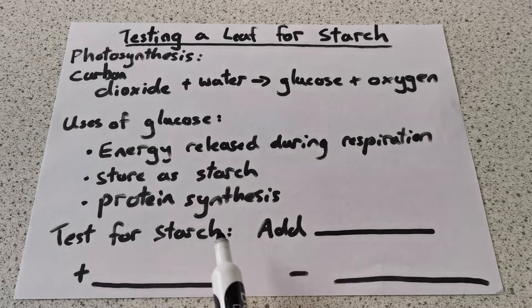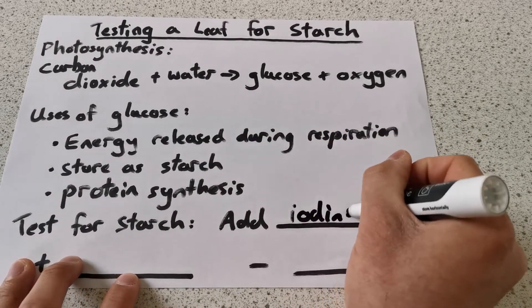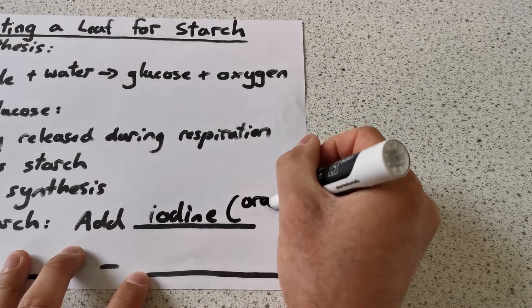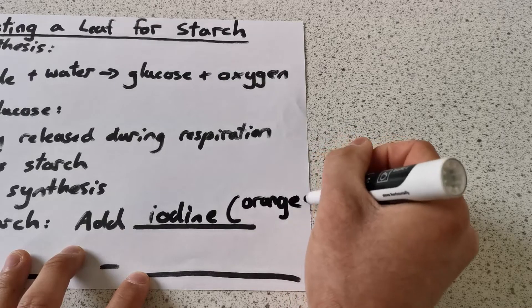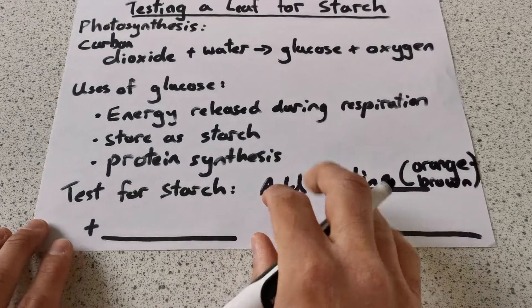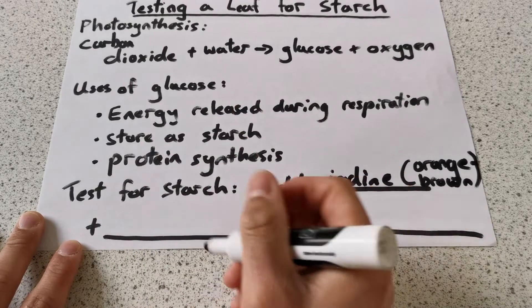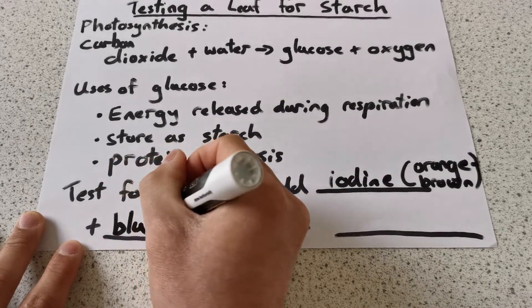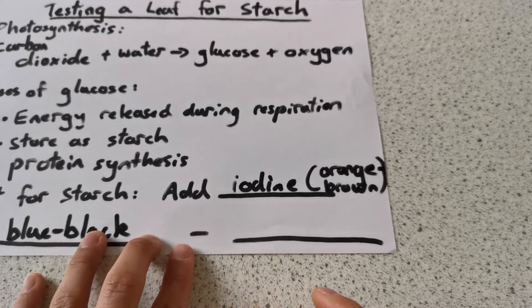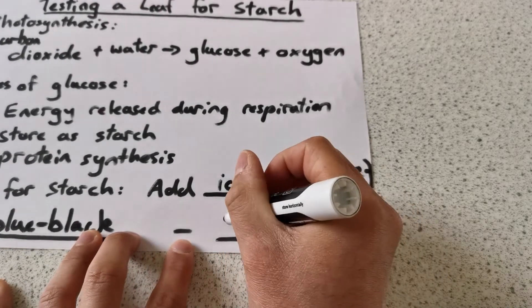To test for starch, we add iodine. Iodine starts as an orange-brown colour. If the test is positive — if starch is present — the orange-brown iodine will turn blue-black. If the test is negative and there is no starch, the iodine will not change and will stay orange-brown.